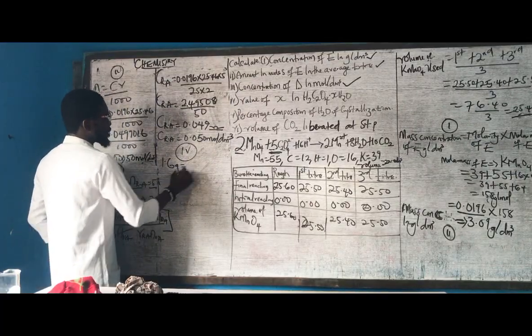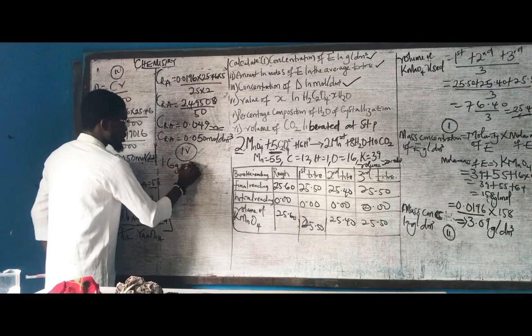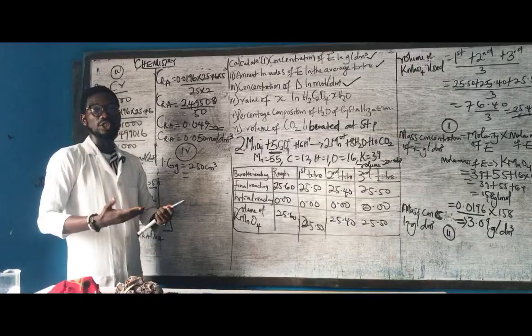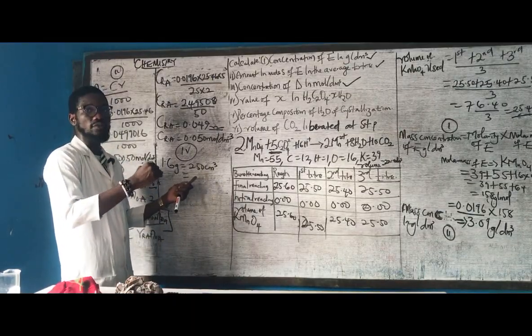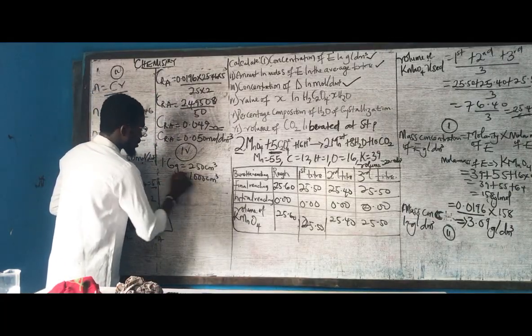Initially when we started the question, I said this is a solution of 1.6 gram in 250 cm cube of oxalic acid. So if you are just coming across the video, I would advise you to kindly rewatch the video. When we try to measure the oxalic acid, we are not to dissolve in 250, rather we have to dissolve in 1000 cm cube. So we have 1000 cm cube, and here we have x.